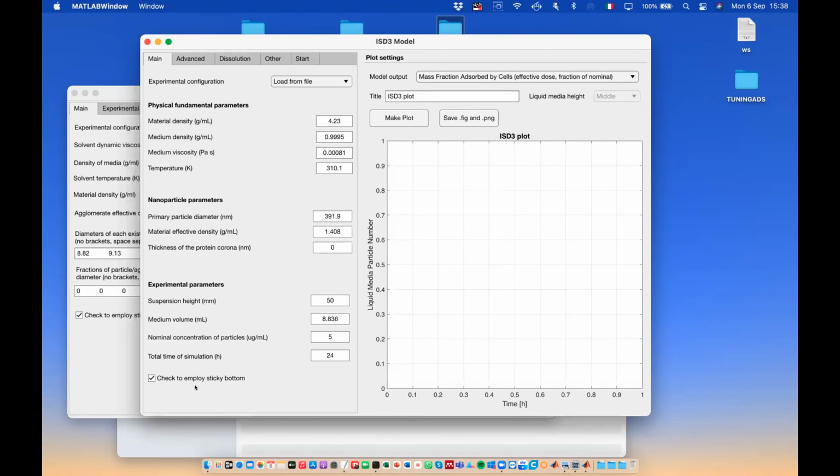But sure, this value can change and are dependent on the media used. So if you would like to be more specific and you would like to replace and use this model, you have to have this information. So far, we are on the project. We have some of those data available, and depending on the media that you use. I hope that I answered your question, Marie.